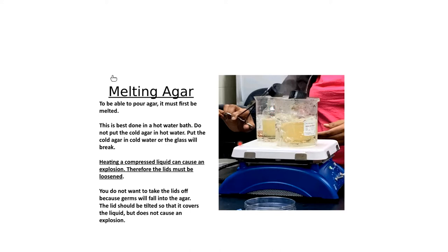I like to put a hot plate with a beaker on it and put the glass jar in here, but very important to remember: heating a compressed liquid can cause an explosion, so you're going to have to loosen the lids and not just loosen the lids but tilt them to the side. You see the lady here has a sterilized little tong that she's using to put this sideways because it's hot.